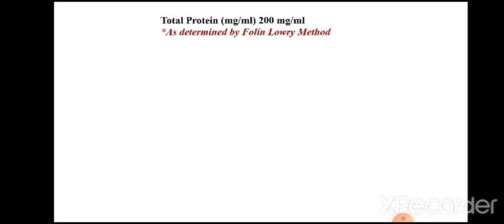Now we know that the next part we have to determine is determination of specific enzyme activity. Specific enzyme activity means the activity of that enzyme in the given preparation of protein. So you have a protein solution, it will be a mixture of proteins. Among them, your desirable enzyme is one of them, and you want to determine what is the activity of those amylase molecules present in that protein mixture preparation. That is called specific activity.